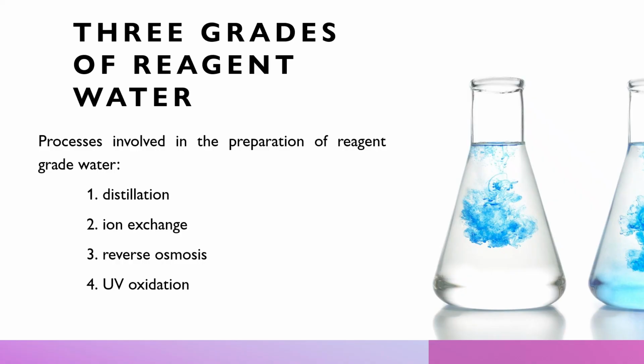Next is the special reagent water. The third is instrument feed water. Fourth, water supplied by method manufacturer. So this is the water that is supplied from your manufacturer. The fifth one is autoclave and wash water. And lastly, the sixth category is the commercially bottled purified water.